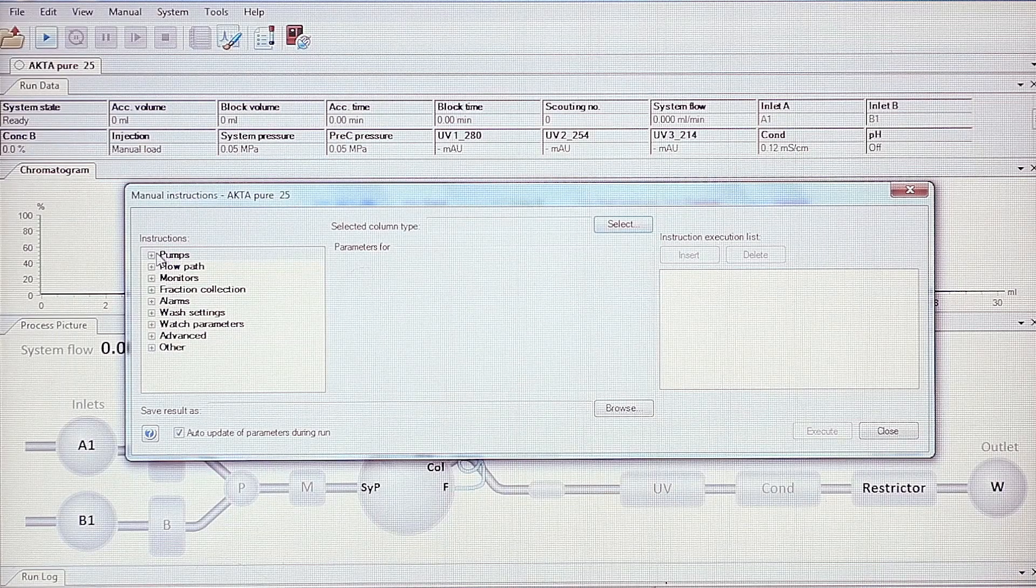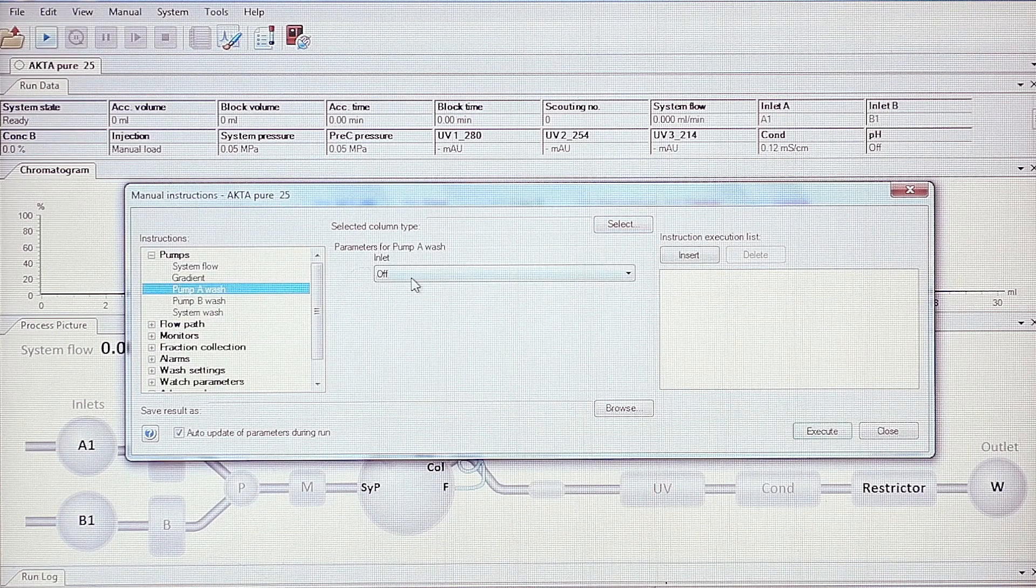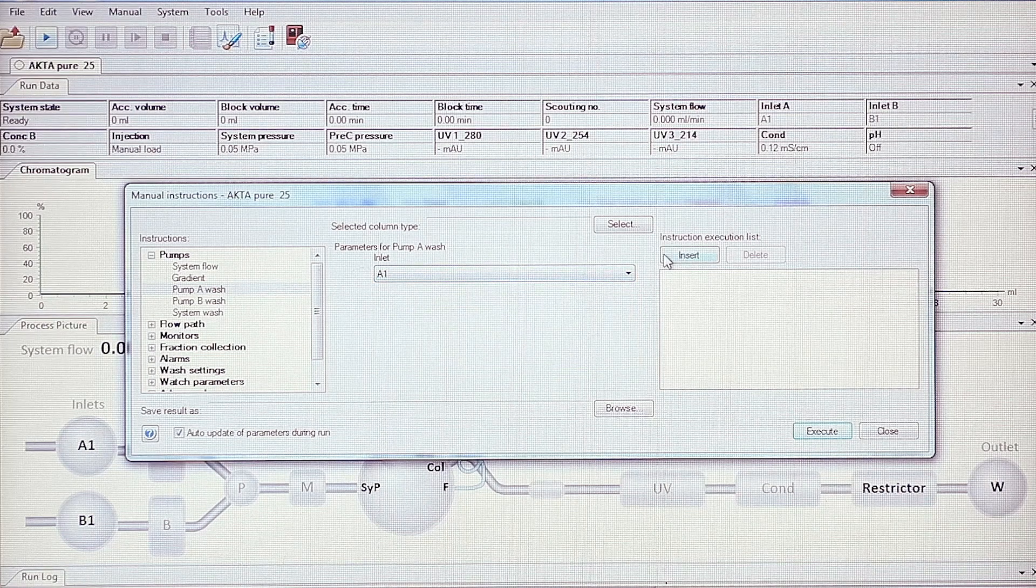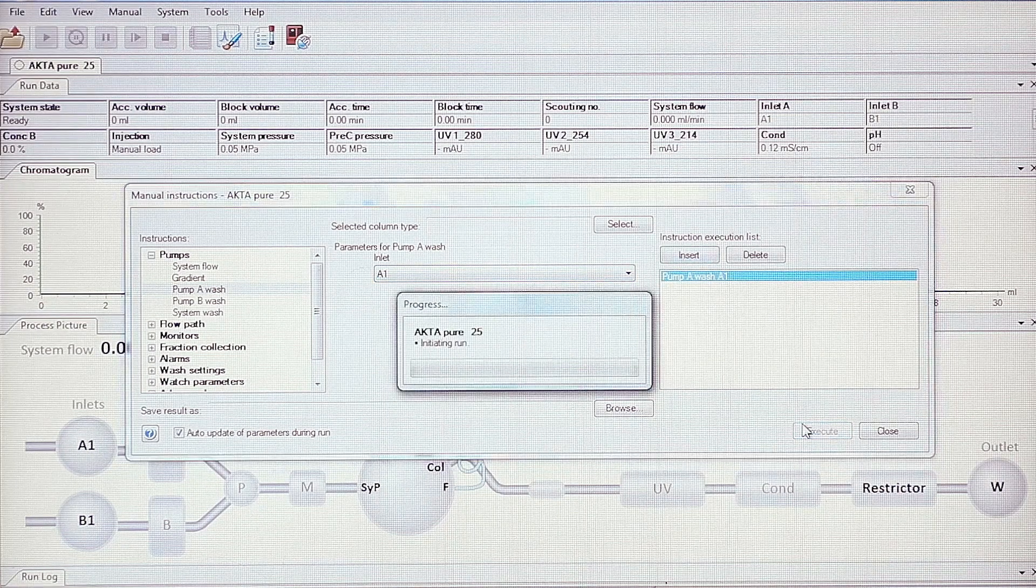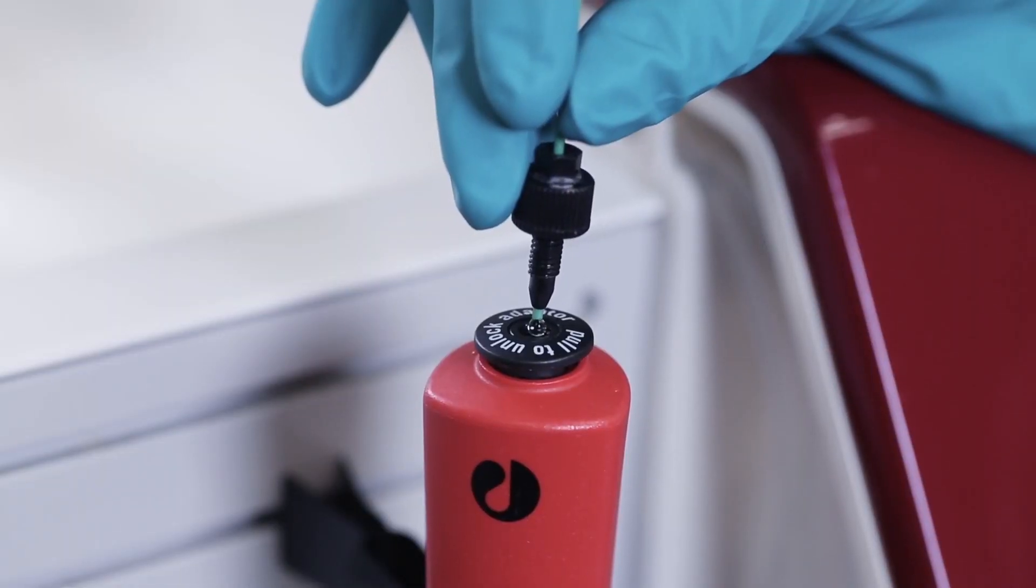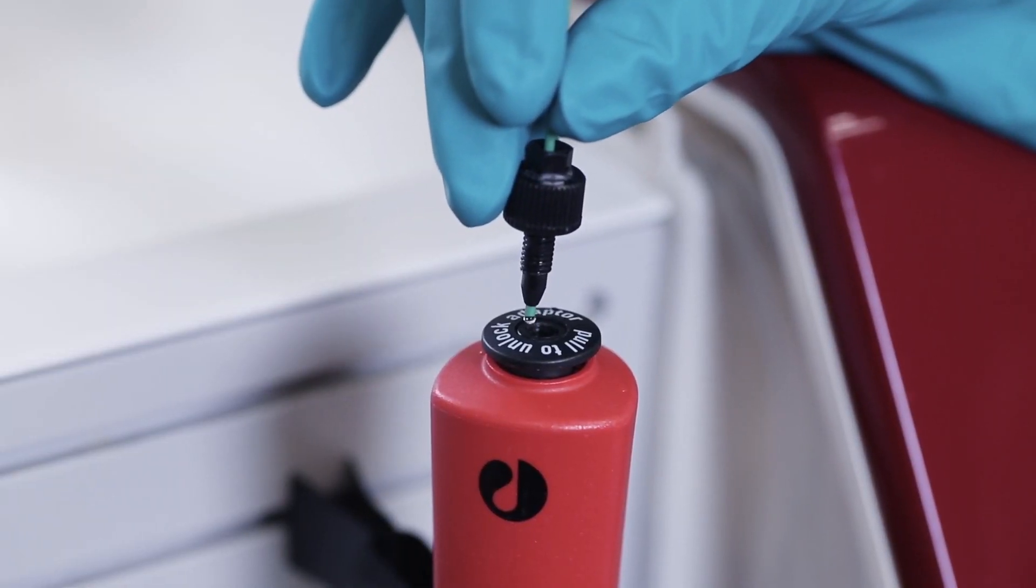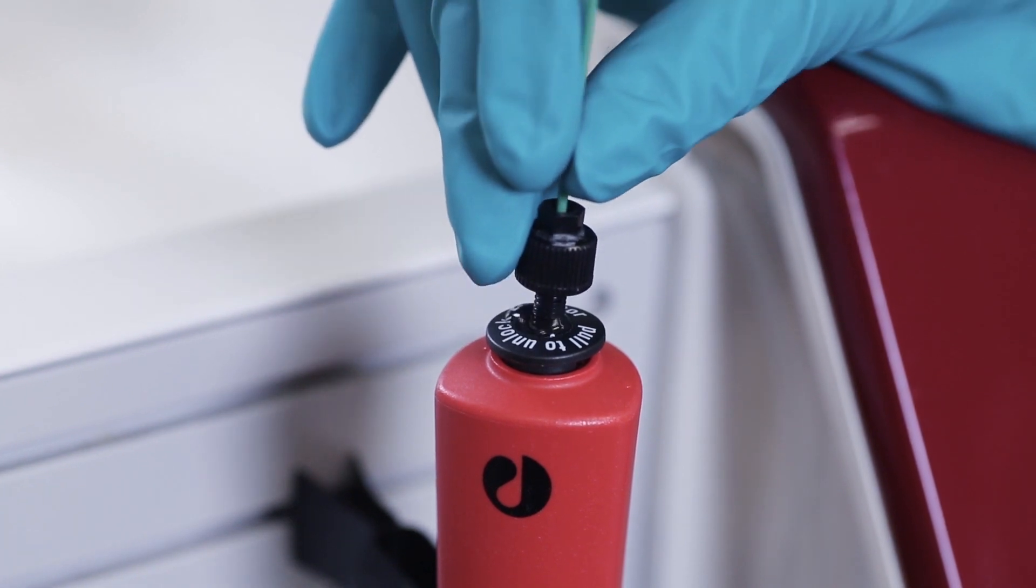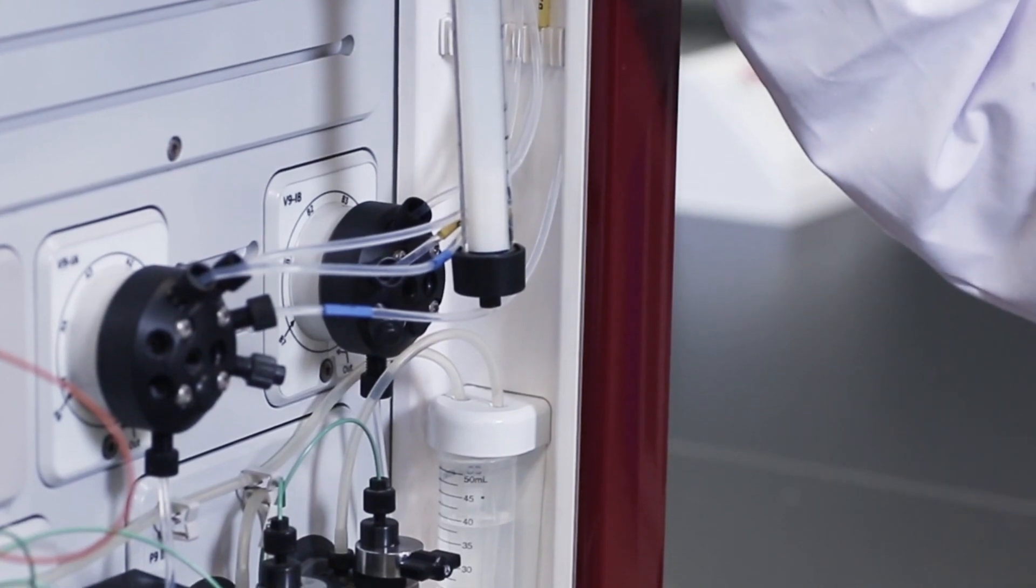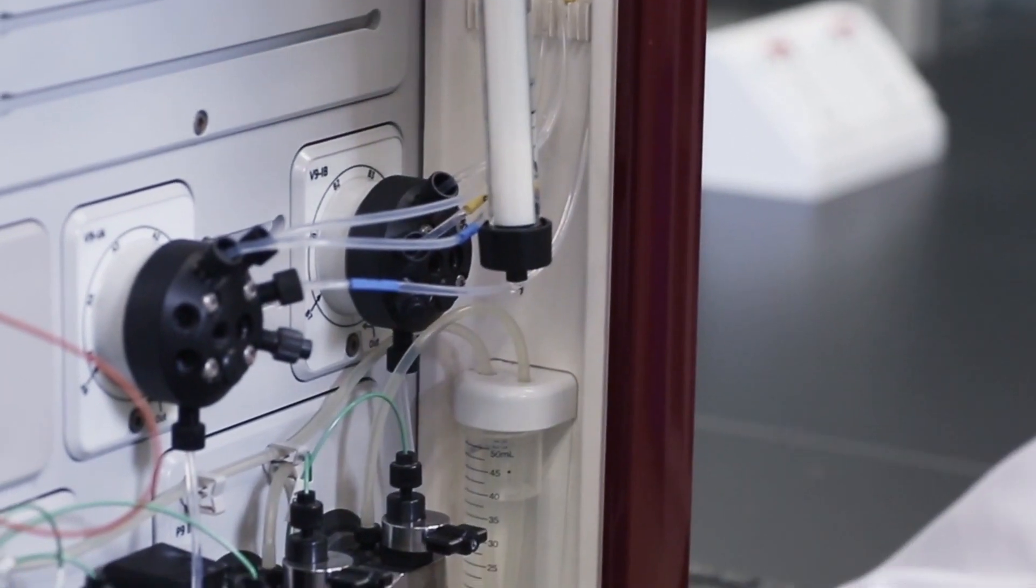Use the pump wash function in Unicorn to remove any air in the system or tubing. Ensure that the pressure alarm is set according to the column hardware specification. See the column instructions for details. Start the pump and attach the tube to the top of the reservoir at low flow rate with a drop-to-drop connection. Avoid introducing air bubbles. Place a beaker for waste under the column and remove the stop plug.